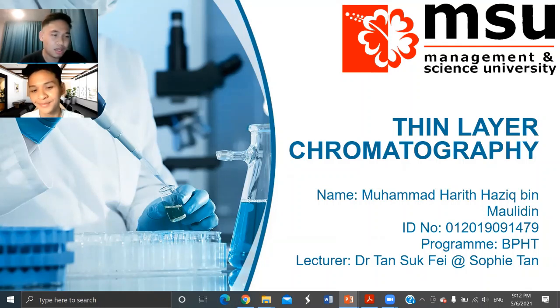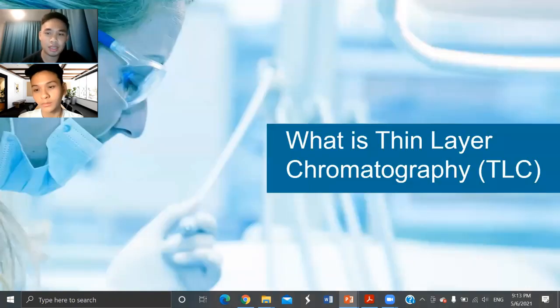In this topic, what you are going to learn is the basic principle of what thin layer chromatography, or TLC, is, and the definition, the methods, and the purpose of the TLC. Okay, TLC is thin layer chromatography. Next, what is thin layer chromatography?